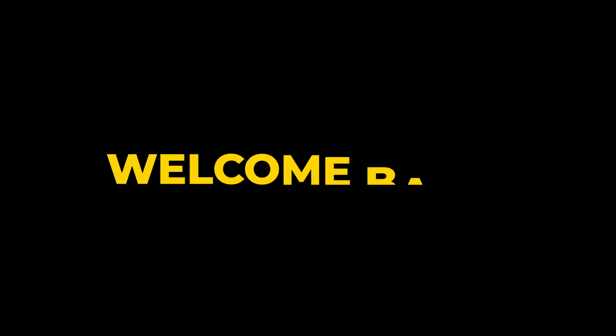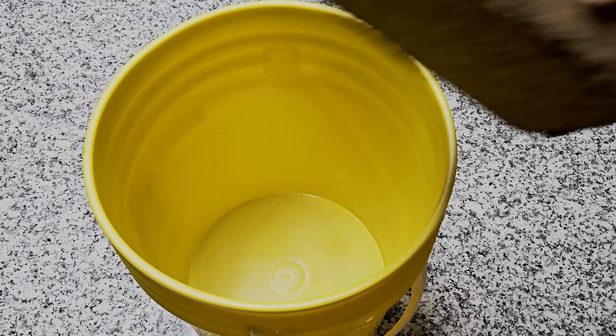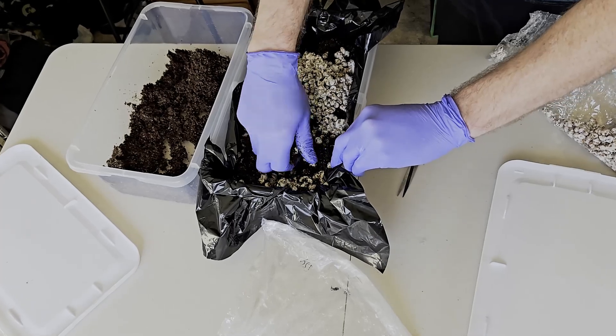Hello and welcome back. In the last video we learned how to inoculate spawn. In this video we'll cover how to make substrate and spawning to bulk with shoeboxes. This is the last step before we begin fruiting.